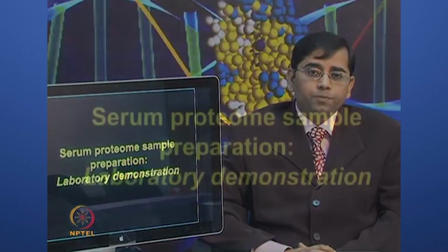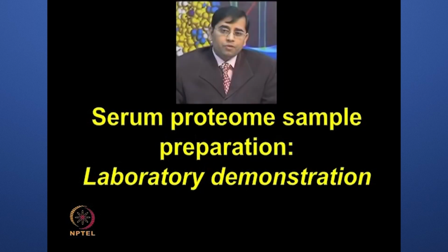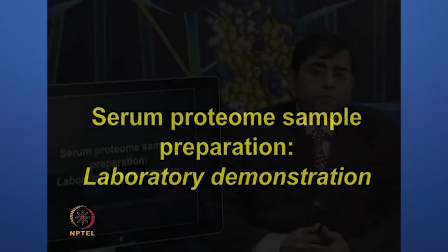So, now let me show you the laboratory demonstration of serum proteome sample preparation. By watching this video, you should be able to learn the very minute details about performing the serum sample preparation and how one can use that for further serum proteome analysis.